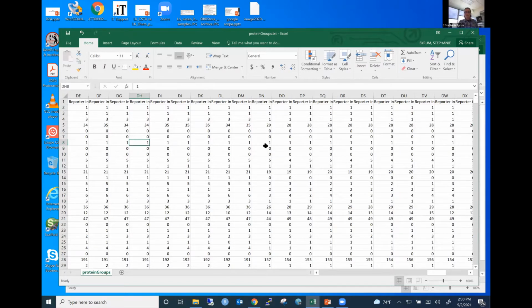Thank you. Yeah, and that's something if you do a label-free project with count data, like we do with IP experiments. So you would take one that's a pull down, where you're trying to find all the proteins associated with a particular antibody versus a background control. And so for count data, we set a filter that it needs to have 8 spectral counts or more to be out of that kind of contaminant level. So you can have some filtering at the count level with label-free type data as well. All sorts of things you can do with data. That's what makes it fun, right?